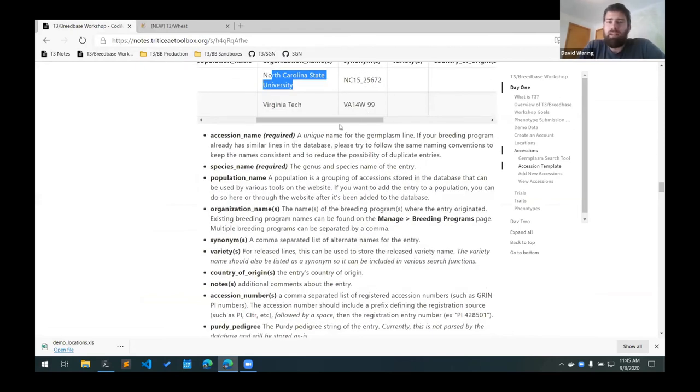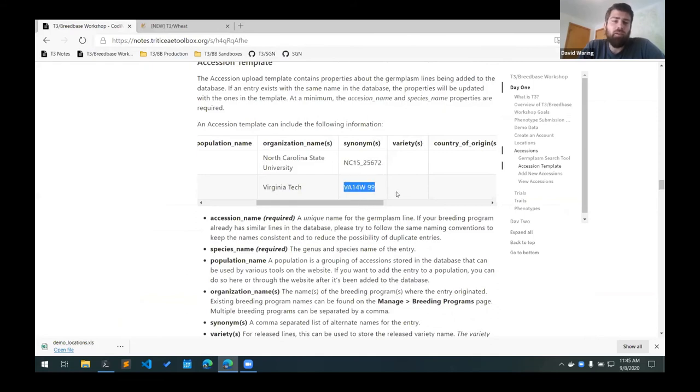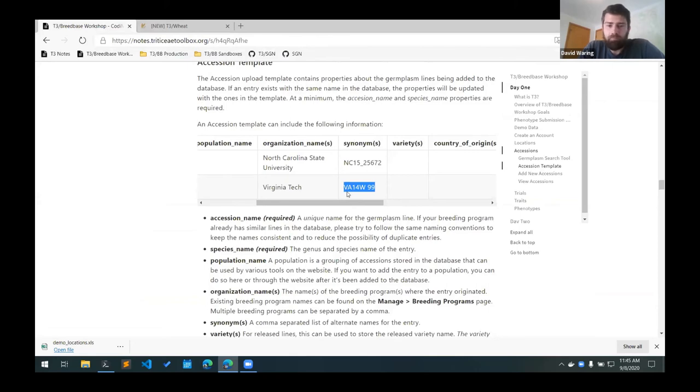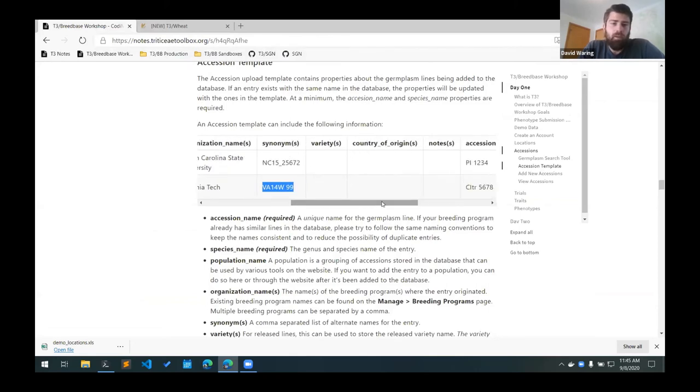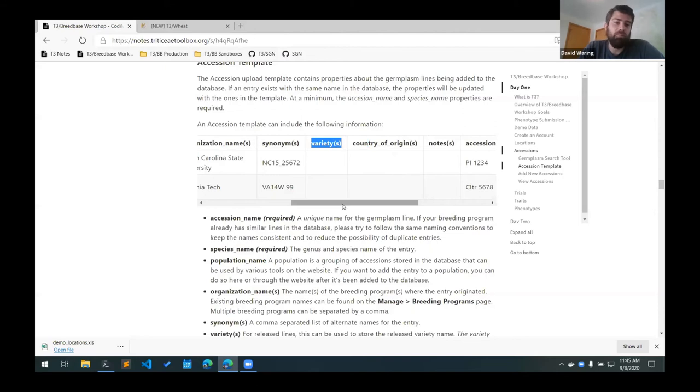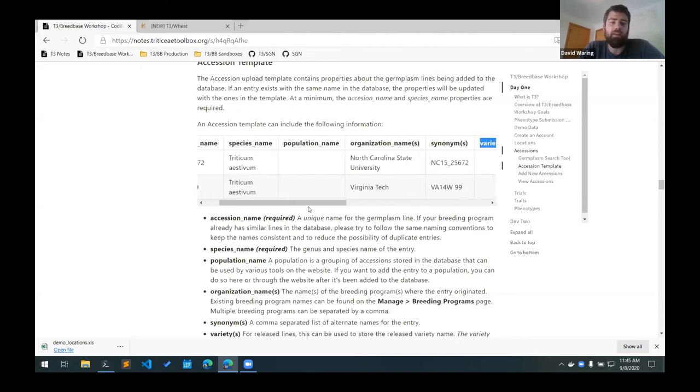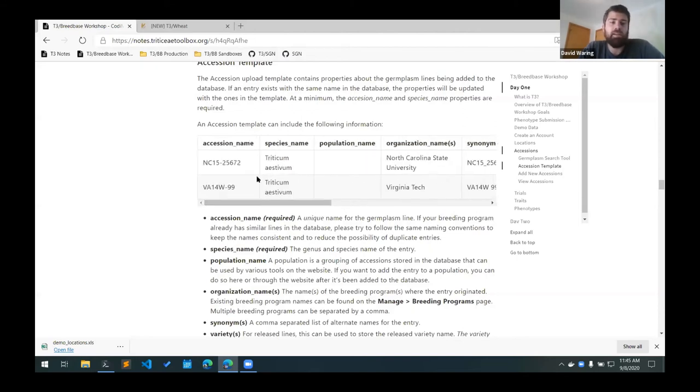Then the synonyms column includes any alternate names for the line and you can include multiple synonyms. They just have to be separated with a comma. The variety column we're using as the release variety name. So if the germplasm has been released, you can use this to give it the variety name, particularly if it's different than the accession name.